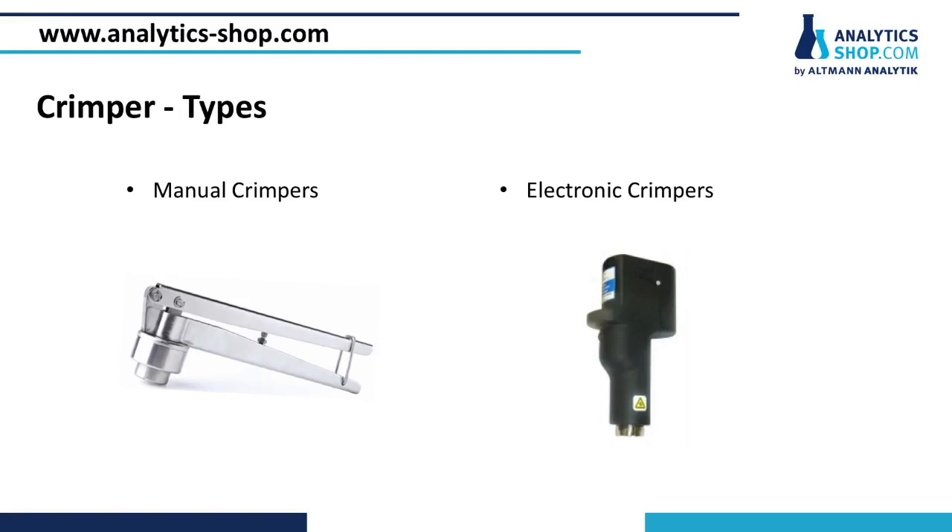Hello, my name is Claudia and today I will talk about crimping. Using crimpers to open and close sample vials is a daily procedure in every modern laboratory. There are two different versions common: manual and electronic crimpers.